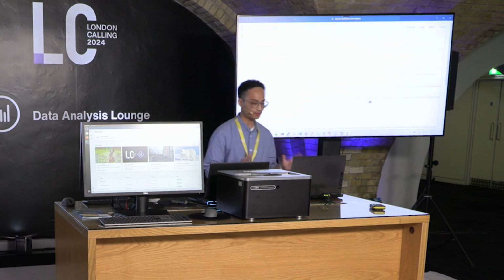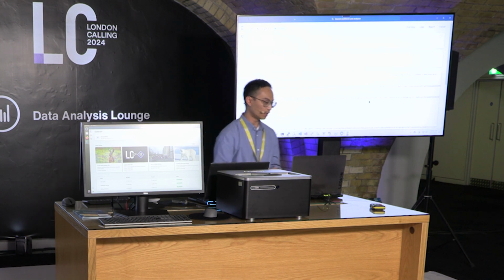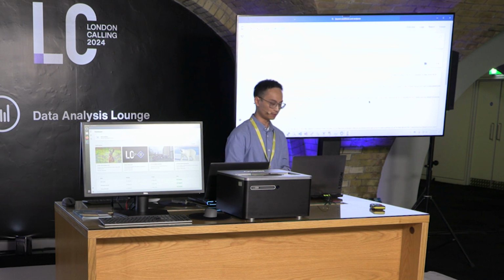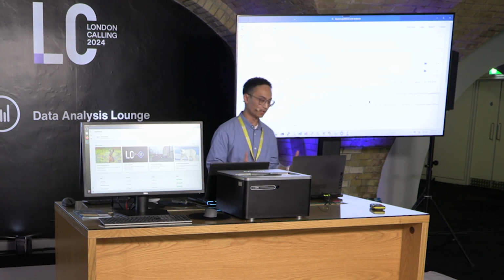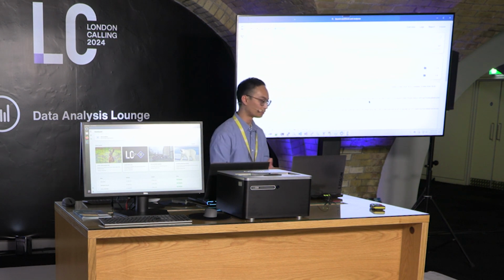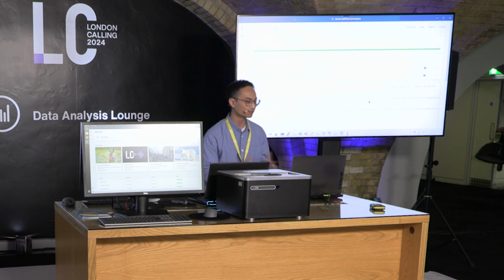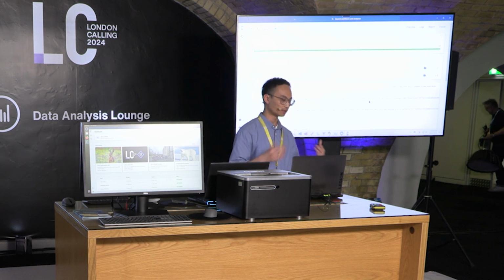Okay, so that will bring us to this screen where we can actively monitor the progress of the different processes in the pipeline, as well as any output files that are generated by the pipeline. I should mention there is one process in the pipeline that is not dependent on any input data. And I find that is a very useful green flag to indicate that the pipeline has successfully initialized. Here we see that there is one process happening and it has completed successfully. So that tells me that the pipeline has been initialized and is currently waiting to receive data.